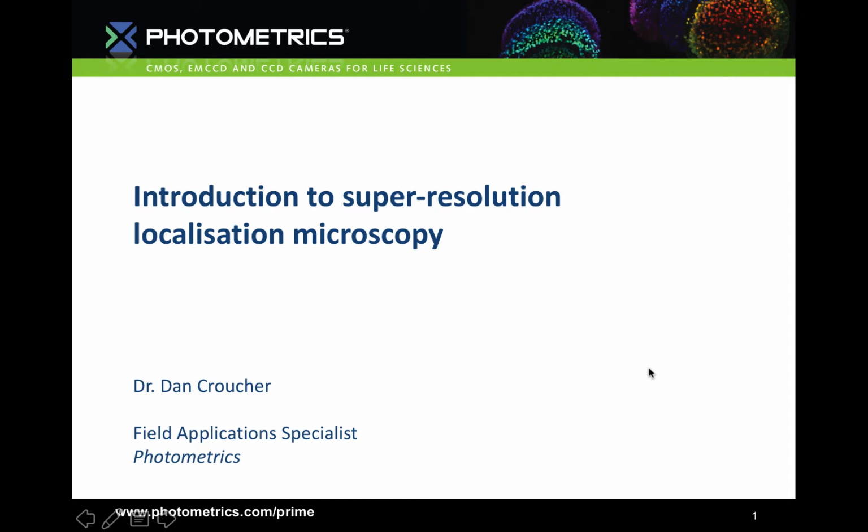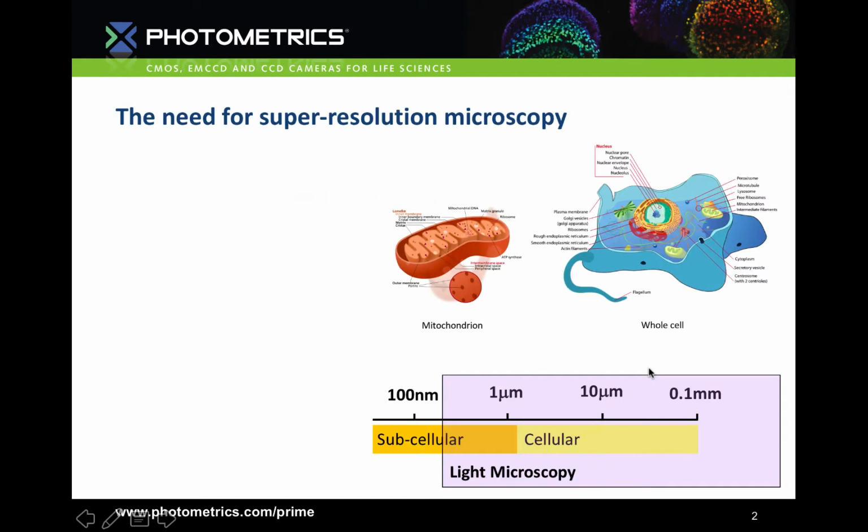Super resolution localization microscopy. So why is super resolution microscopy necessary? Why do we need to surpass the resolution limit of conventional light microscopy techniques such as wide field and confocal?